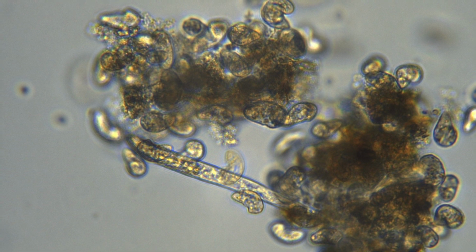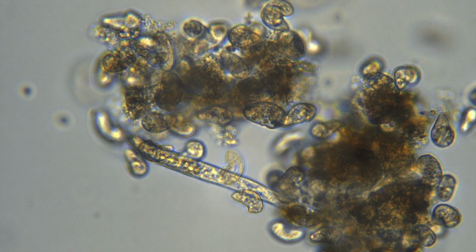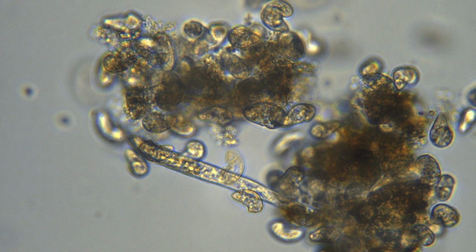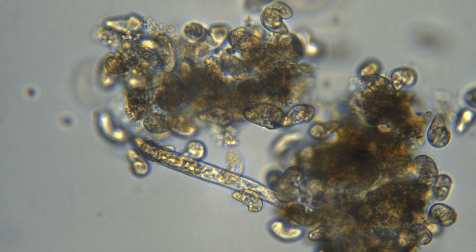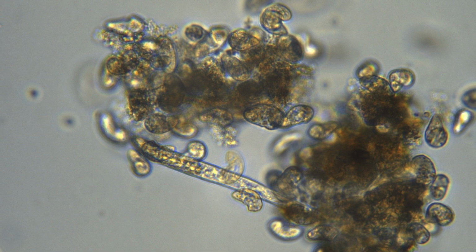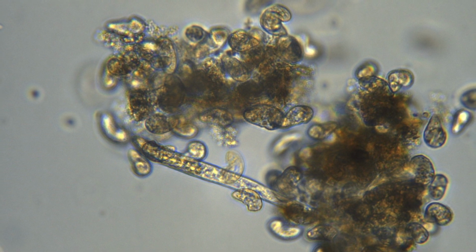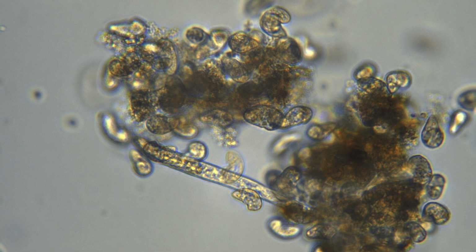That's actually a small type of worm called a nematode. Different organism, very populous organism, lots and lots of different types of nematodes in existence. But I think, with the presence of food, this shows that organisms will come.